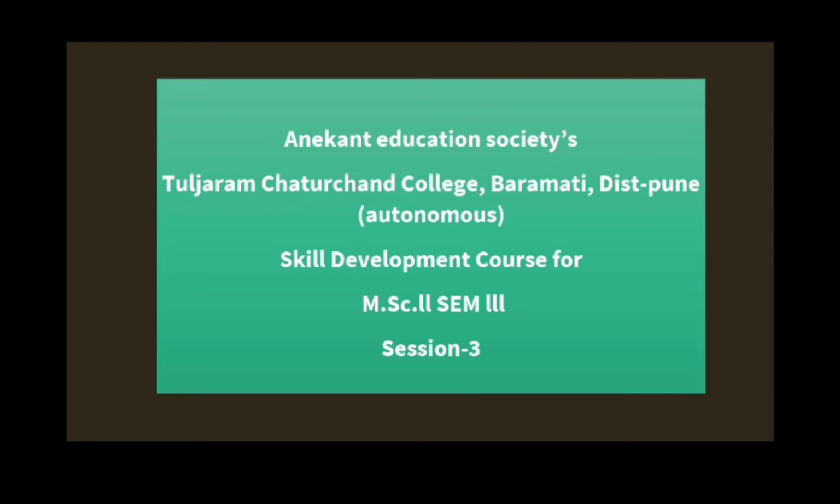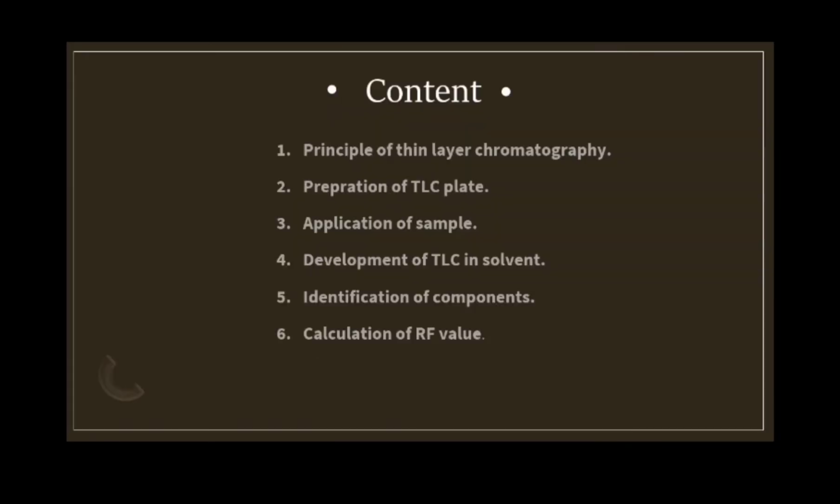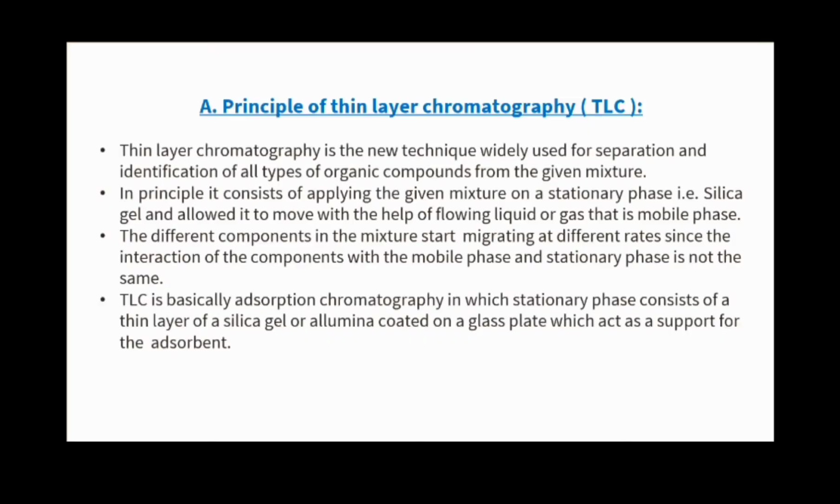Today's topic is thin layer chromatography. So let us start. Today we will discuss these points. First, principle of thin layer chromatography, then preparation of a TLC plate, then application of a sample, and after that development of TLC in solvent, identification of components, and last is calculation of RF value. Let us see our first point.